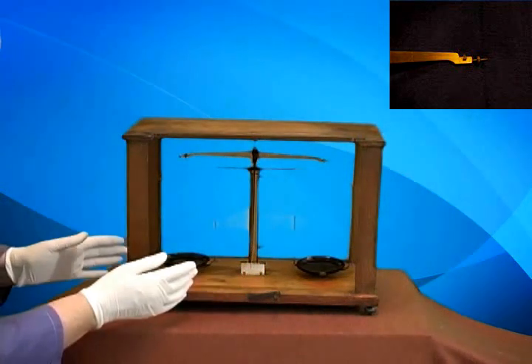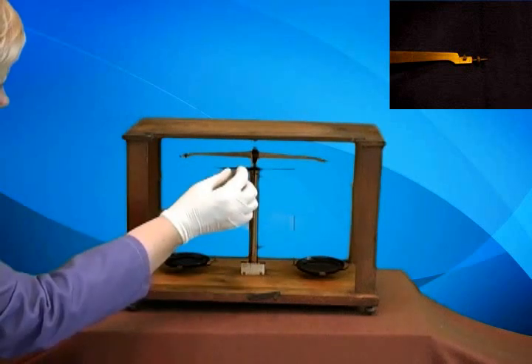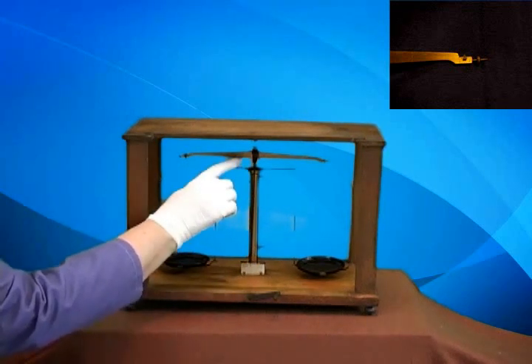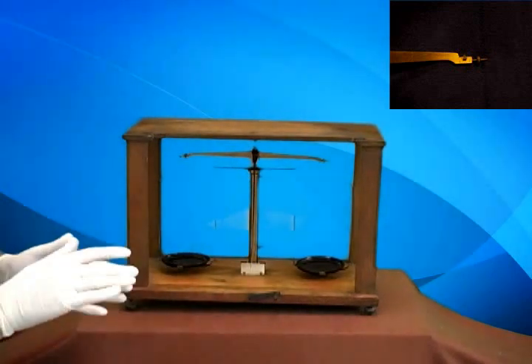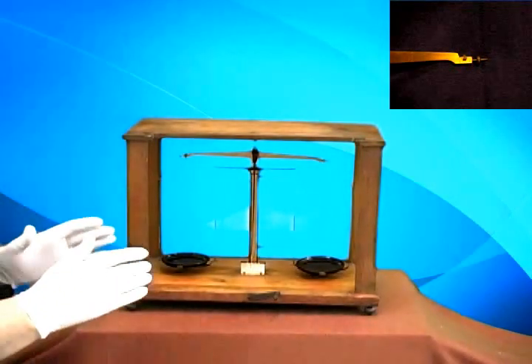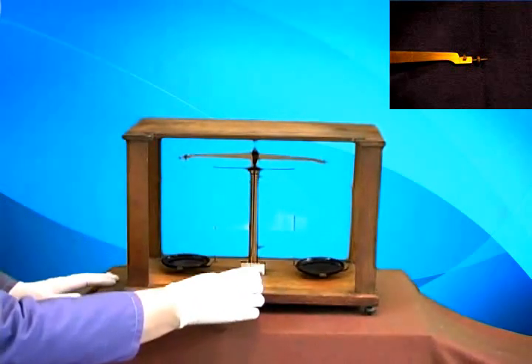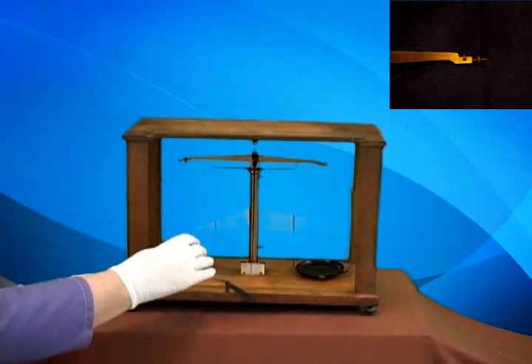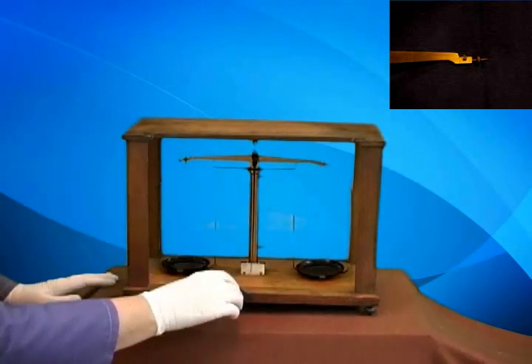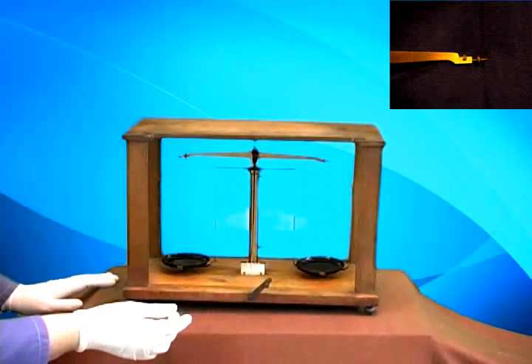Now, you had to be very careful with this device because those finely honed knife edges up here in the beam were very sensitive to any changes, and you didn't want to bang them around and notch those beams. So, you would rest the balance and you would change the masses over here, and then you would check again to see if it were being weighed right.